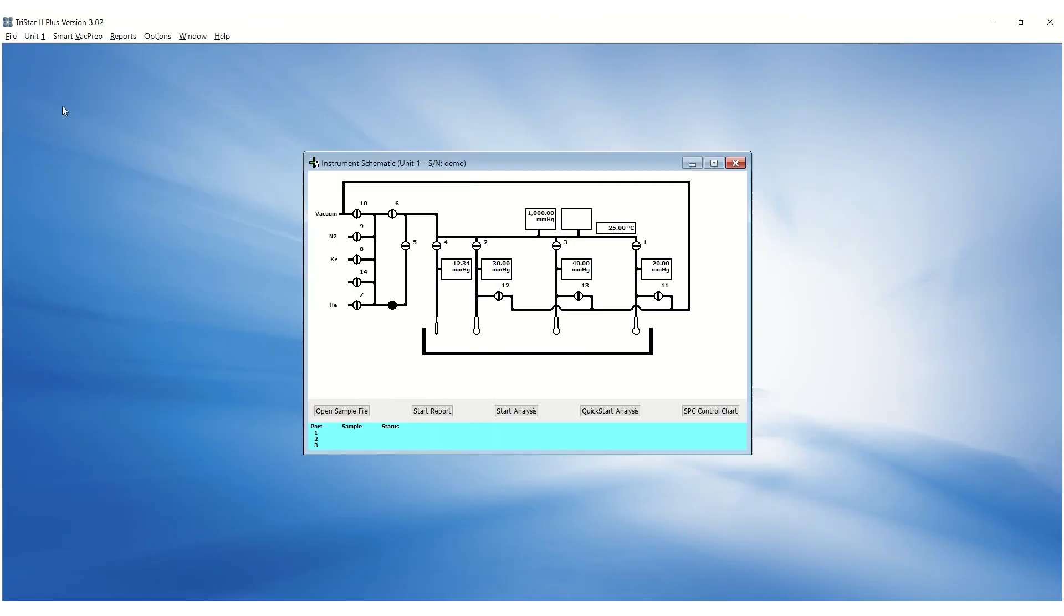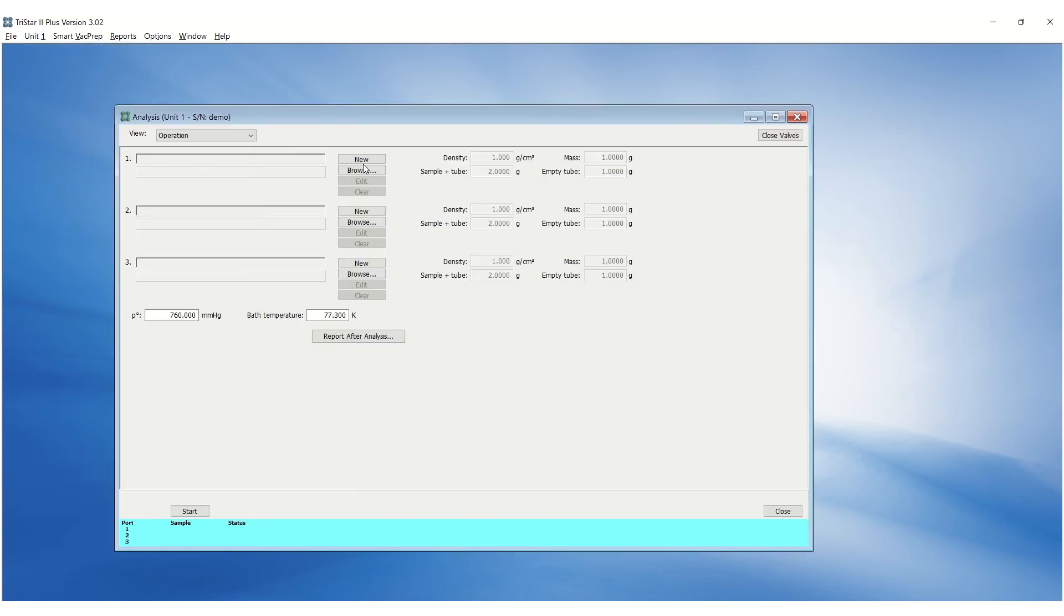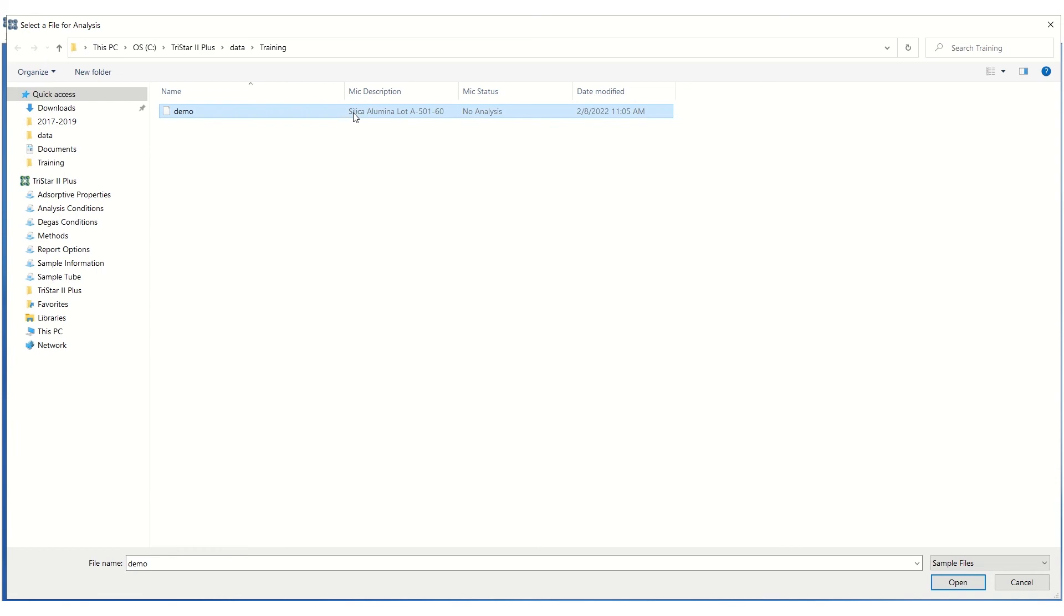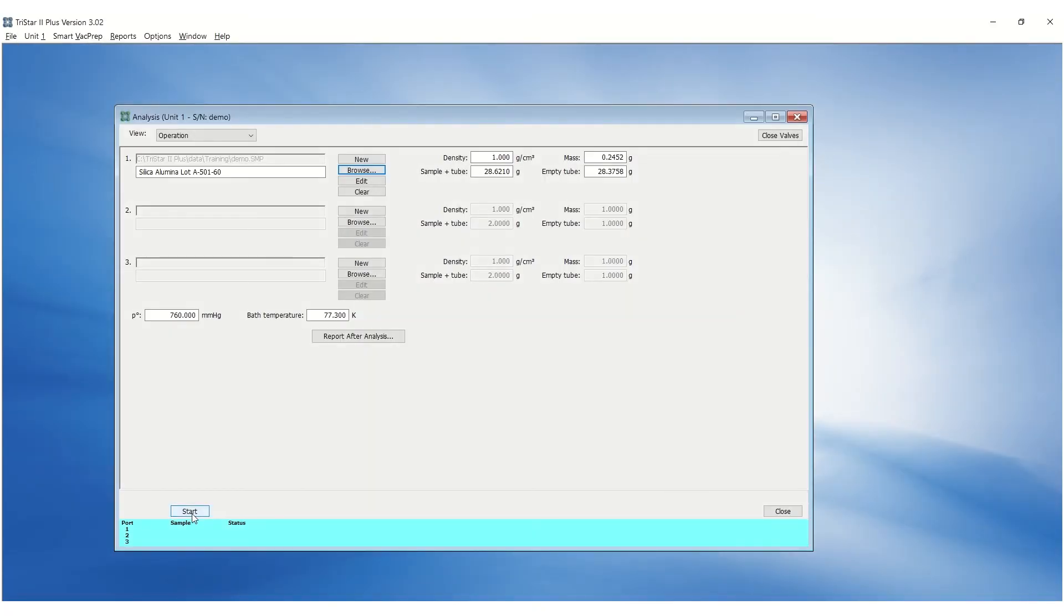To start an analysis, go to the Unit menu and click on Sample Analysis. Browse and select the sample files for the appropriate sample ports. Click Start.